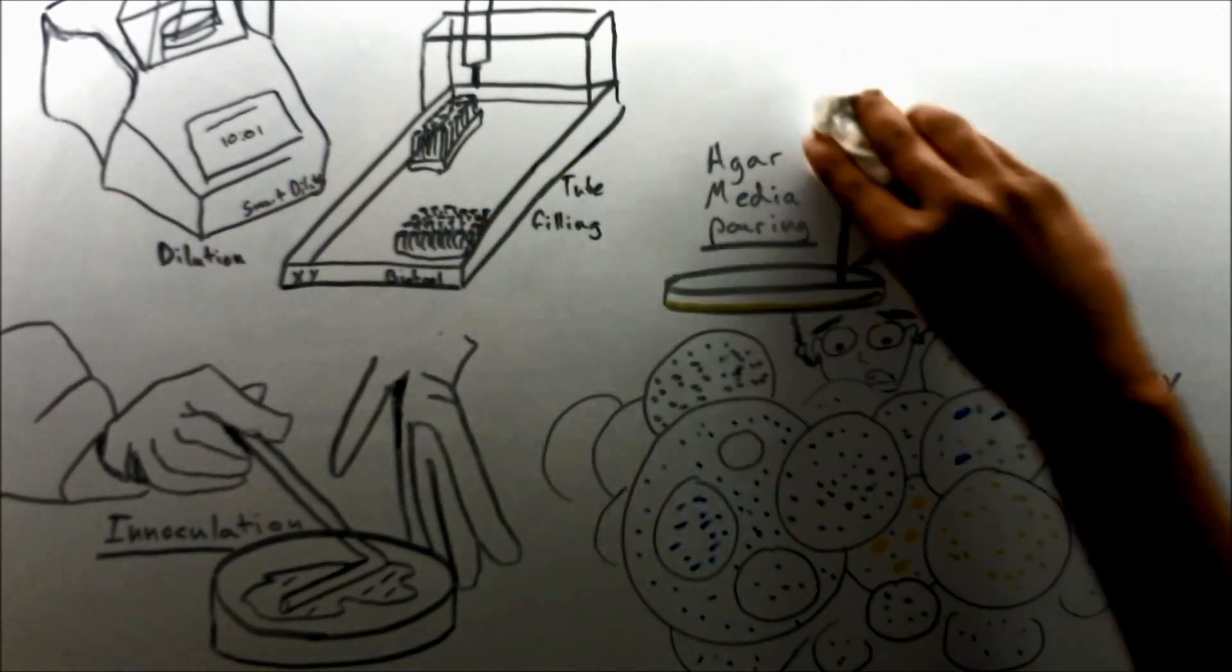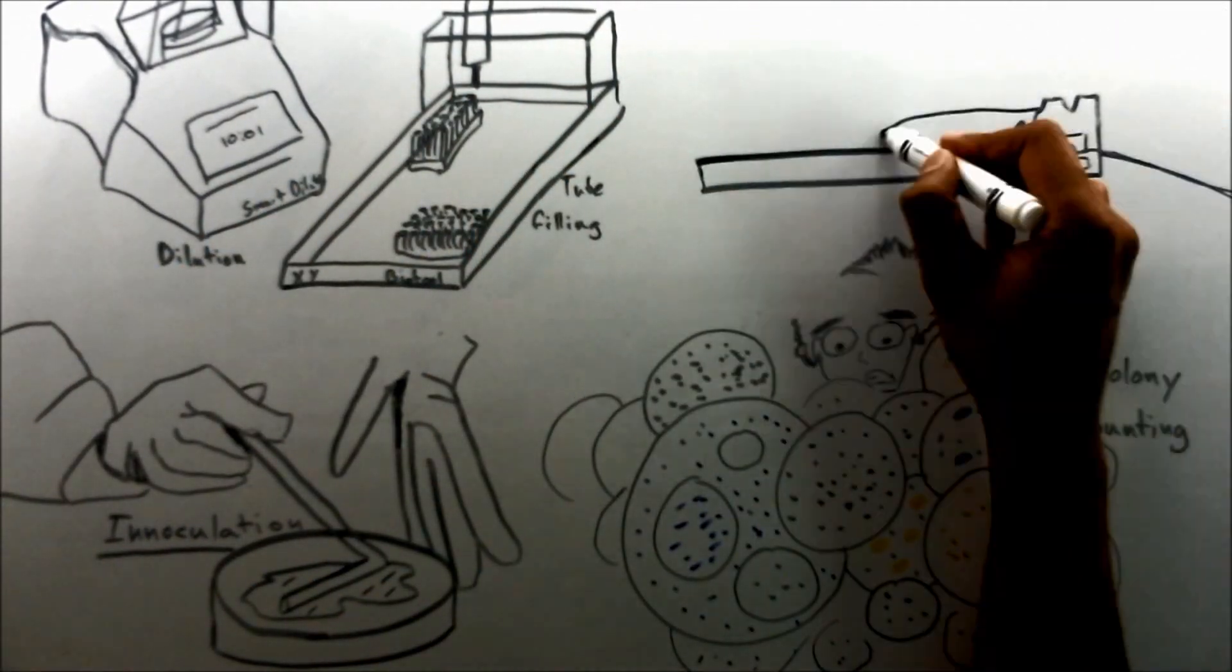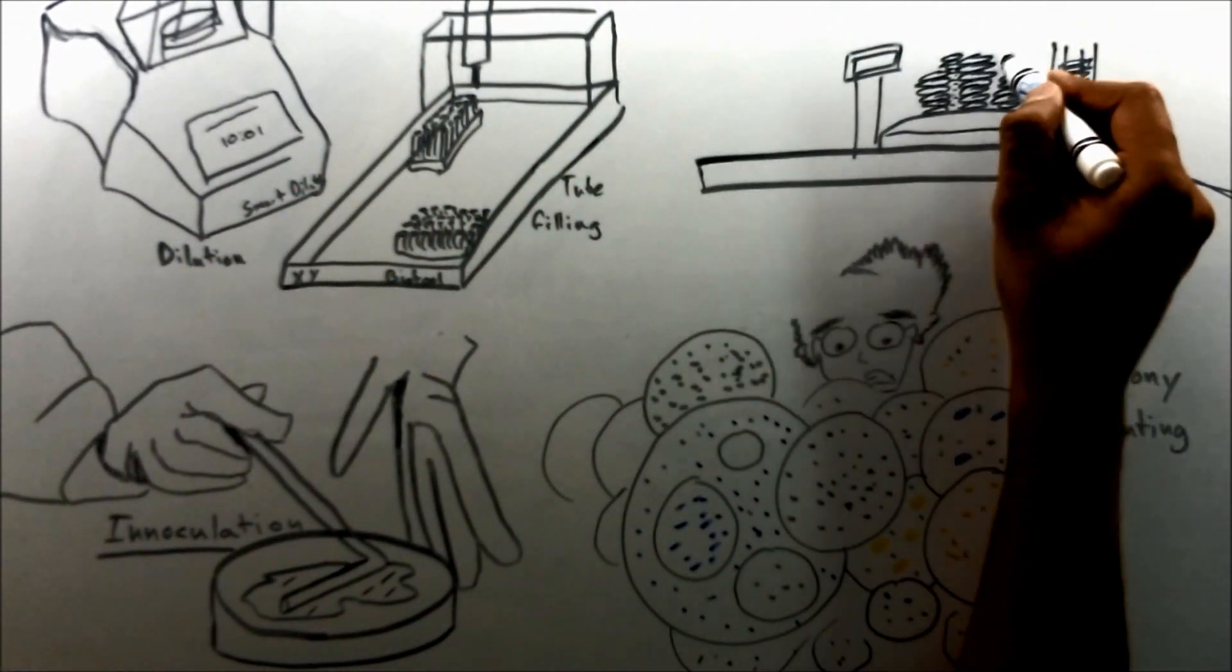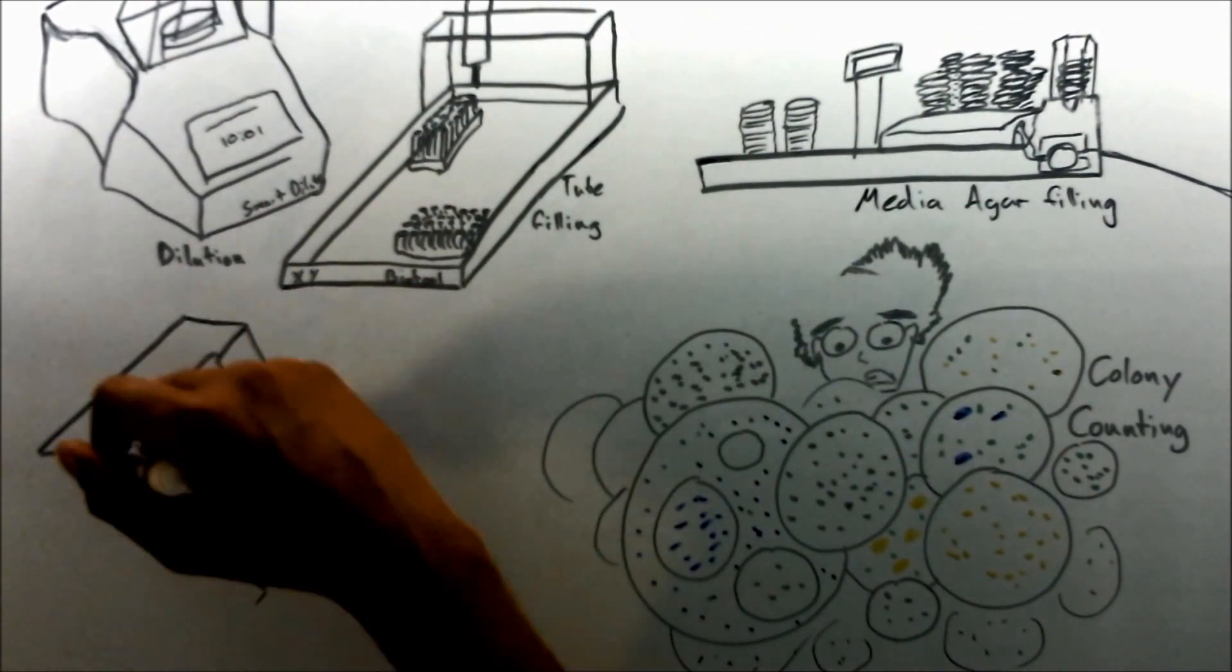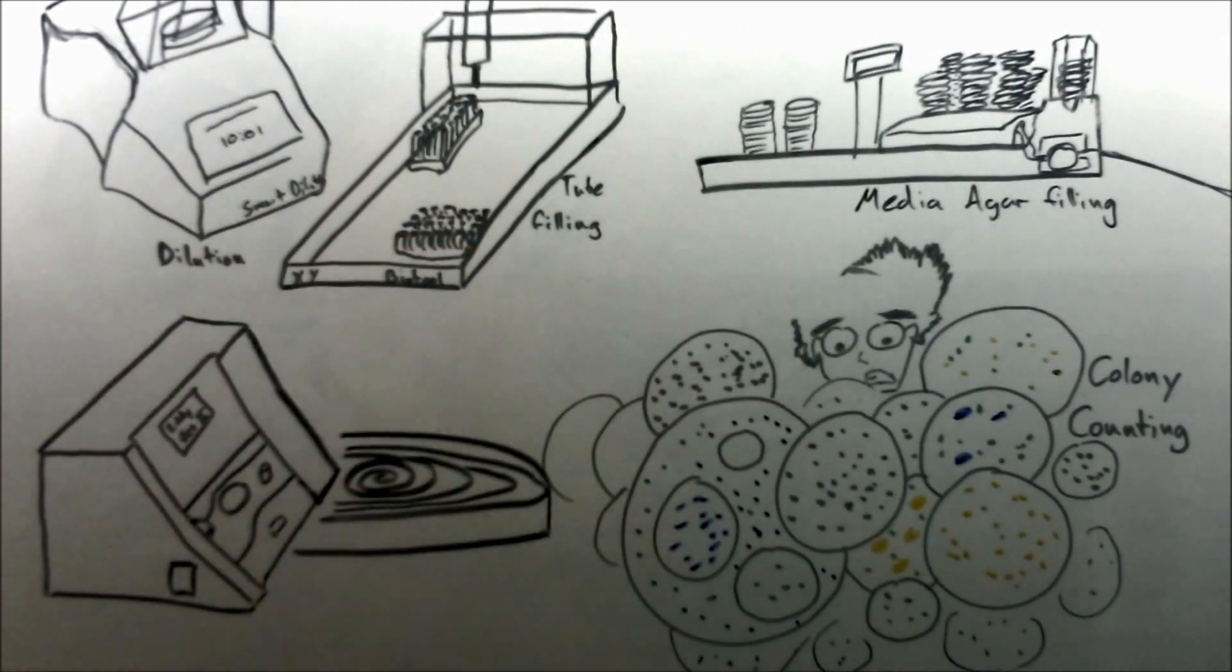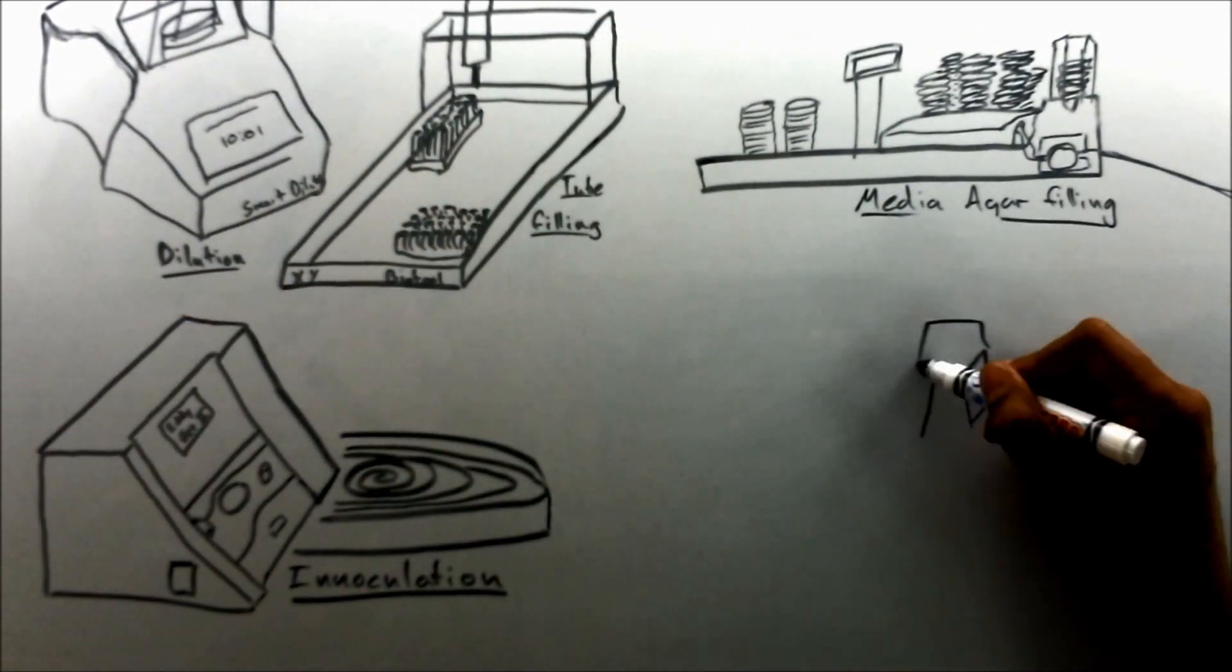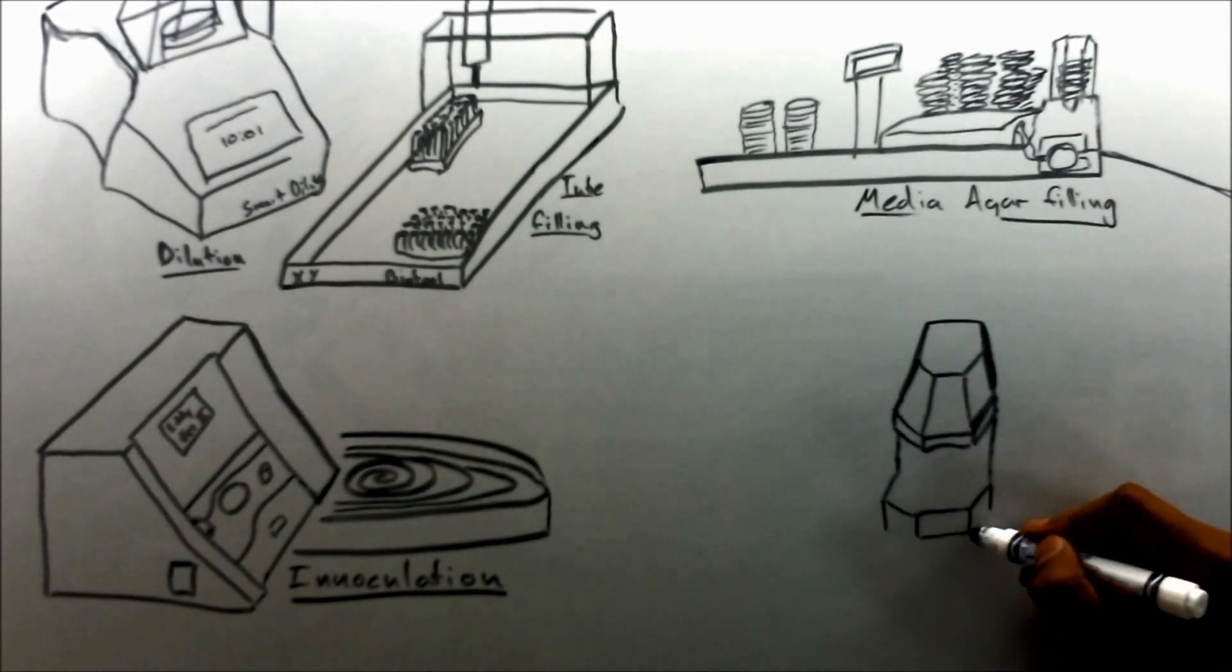Automated dilution and tube filling, automated media preparation and pouring, spiral inoculation and colony counting.